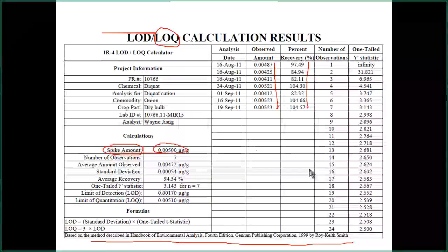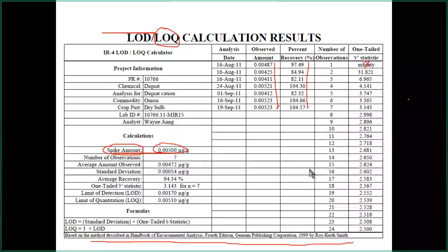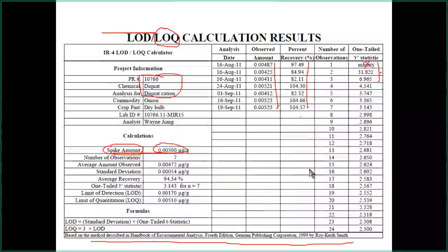Based on this, we do a quick one. We do the student t-test, and then you will have the name there. Of course, if you have one number, there's no way you can do any statistical results. If anything is smaller than 3, the number is totally unreliable. So when you do the statistical results, you have to go above 3. Otherwise, the number is not good. So in this study, on onion, we did 7 levels.